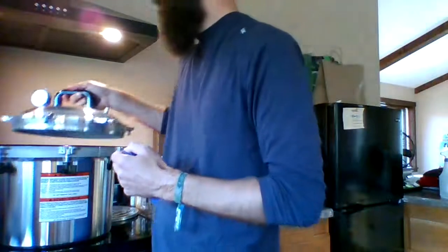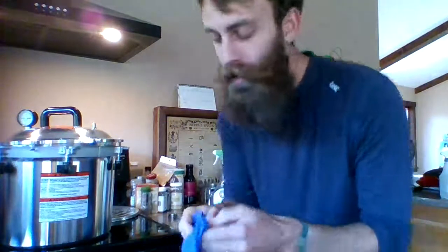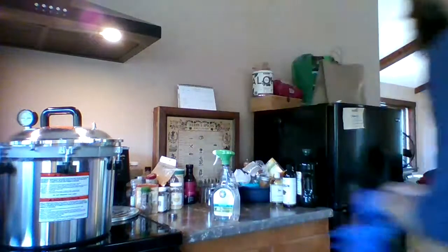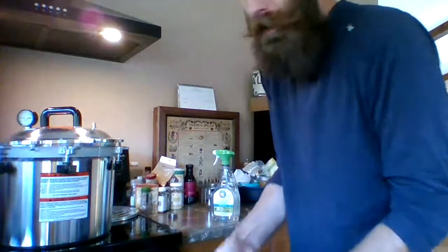Okay, day two of Shrooming with Trevor. And these gloves go on. We're doing the spawn inoculation — might be inoculation, we'll say spawn inoculation. So we put these gloves on, and this is taking longer than I expected.